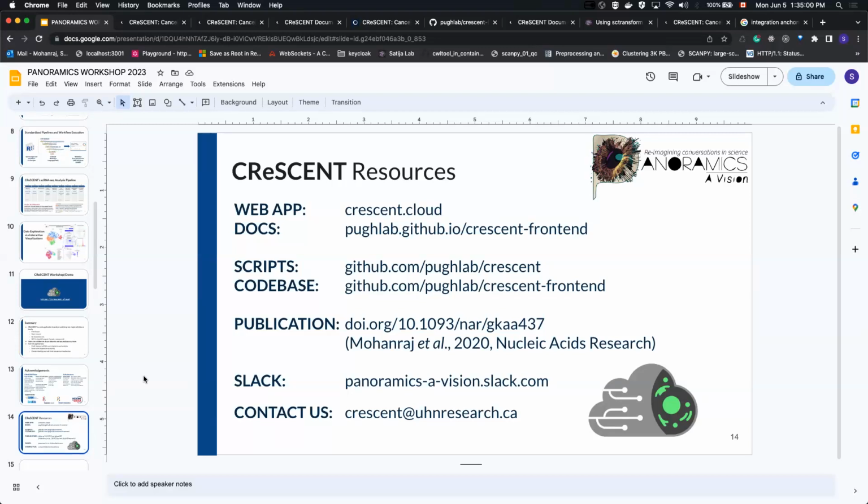So these are tools which we want to encourage everyone to use, so that you don't have to feel left out. It's not only the domain for computational biologists or scientists. We need expertise to come in and join us, to look at a UMAP and tell us that's a wrong cell type labeling, or that your clustering is not differentiating or highlighting.